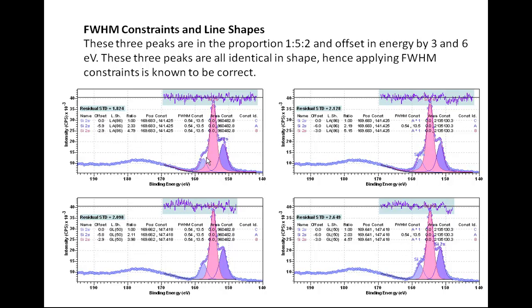The components themselves are designed with line shapes. These top two are Voigt functions that have been optimized based on the individual data that were used to construct these spectral shapes. So these ought to be really quite good approximations to the line shapes, at least the best we can do in terms of a synthetic line shape of this form.